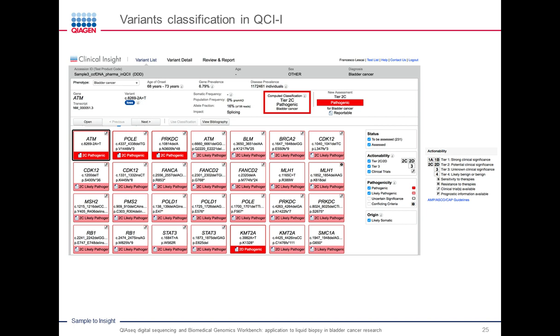And you can see in this slide that although, as I mentioned previously, we cannot rule out the presence of false positives among the higher number of variants that we found in the plasma, it is very intriguing to see that several of these mutations appear to be of interest for bladder cancer and capture that heterogeneity of genomic diversity of the tumor that we know is present in this kind of samples.